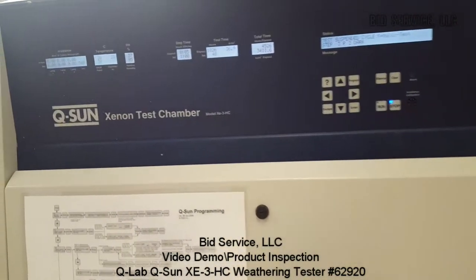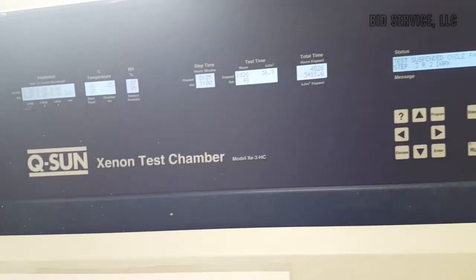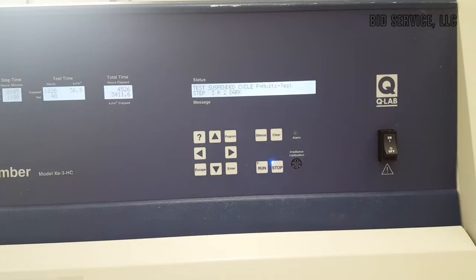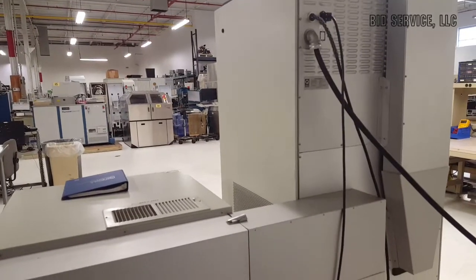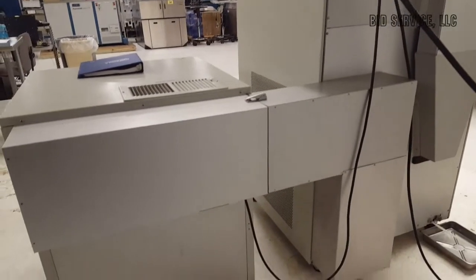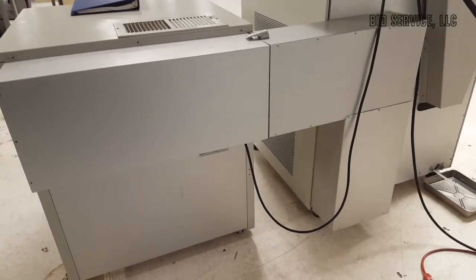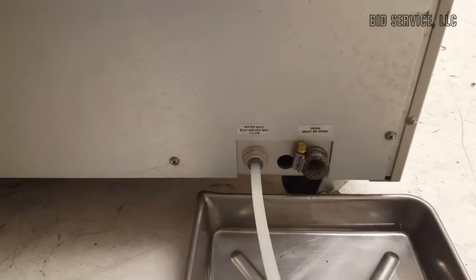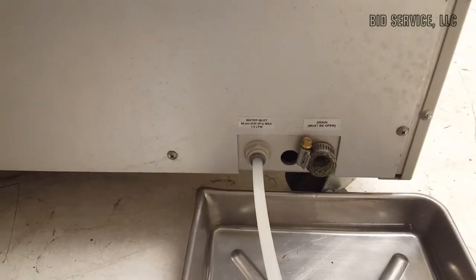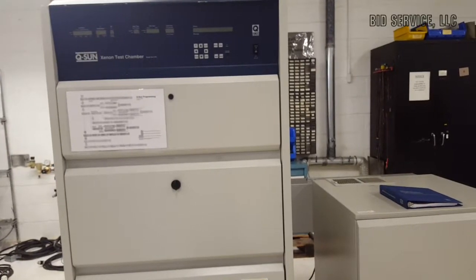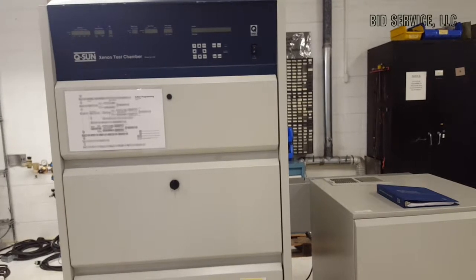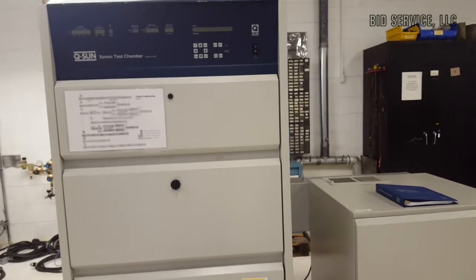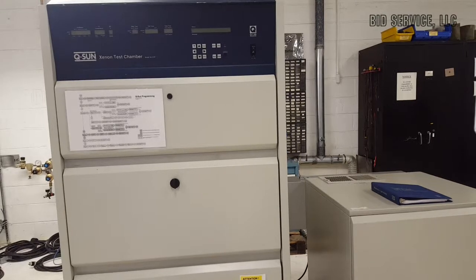This is a demonstration of the Q-Lab Q-Sun XE3HC, Xenon Light Stability Weathering Tester.